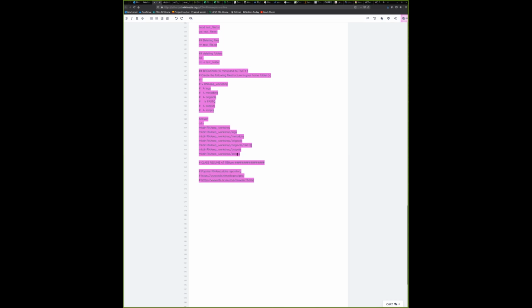And then the last is scripts, or I call it readmes, because it allows me to look at your code, whatever you run, and see how it performs. You can modify your script as and when you want. Okay, so make sure that you have this directory already there, because we're going to use it today, and also in 2 weeks' time we're going to use the scripts a bit more frequently.